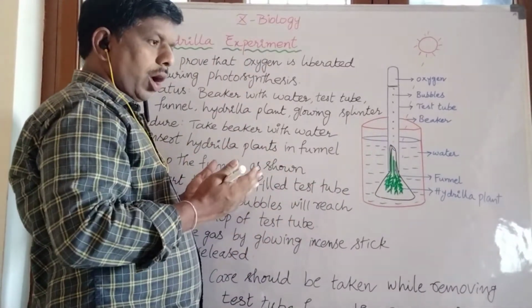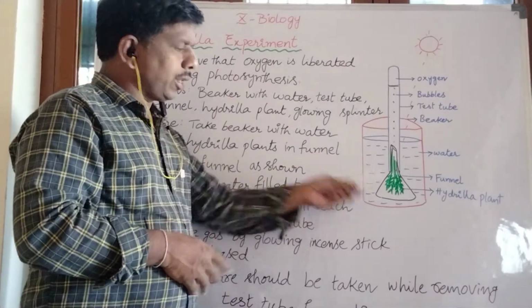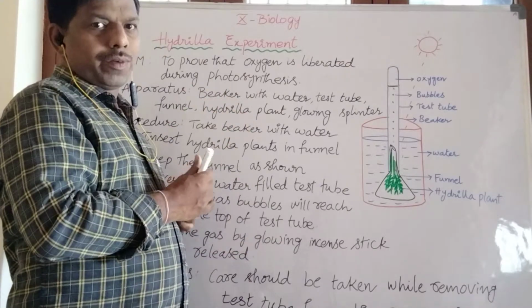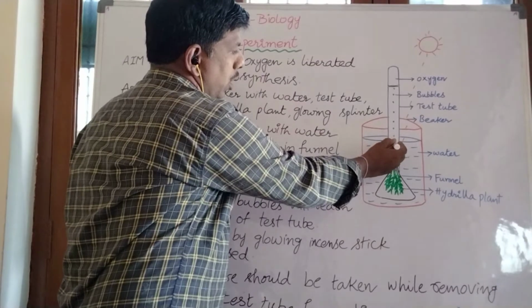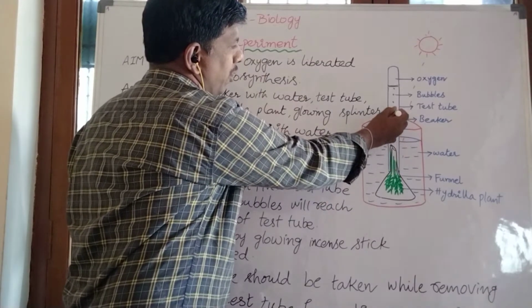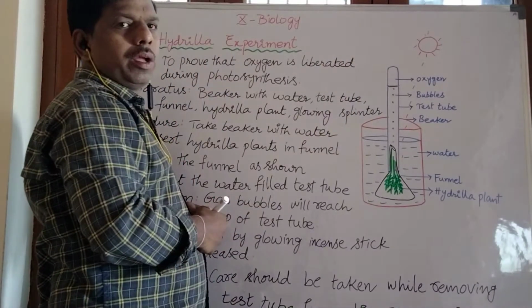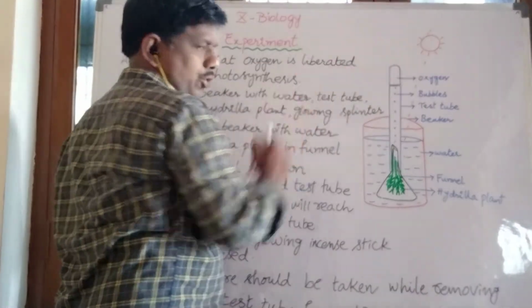So after photosynthesis is performed by the Hydrilla plants which are in the funnel, oxygen is released. Where will that oxygen go? That oxygen will move directly in the form of air bubbles into the top portion of the test tube.